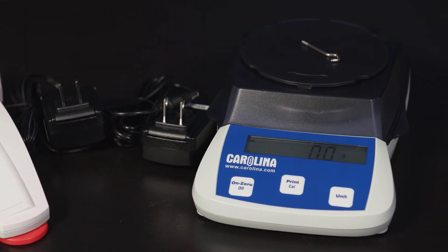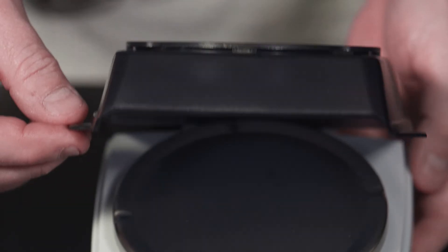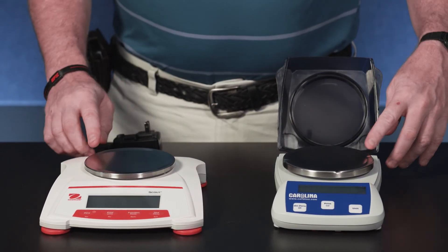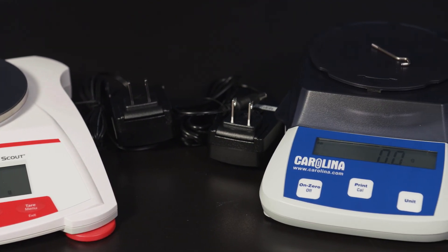The Carolina model can measure in grams and newtons, features a draft shield, and a two-year warranty. It does not have a backlit display. With quality, variety, expertise, and an unconditional guarantee, you can't go wrong with either model.